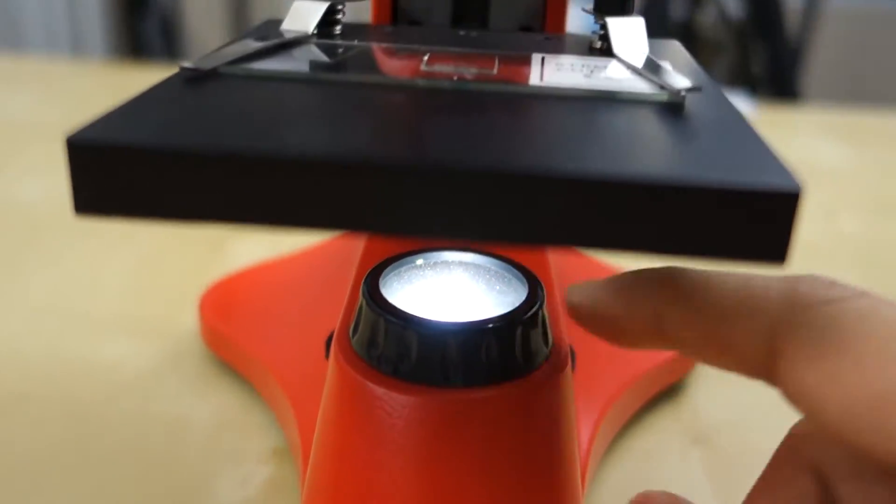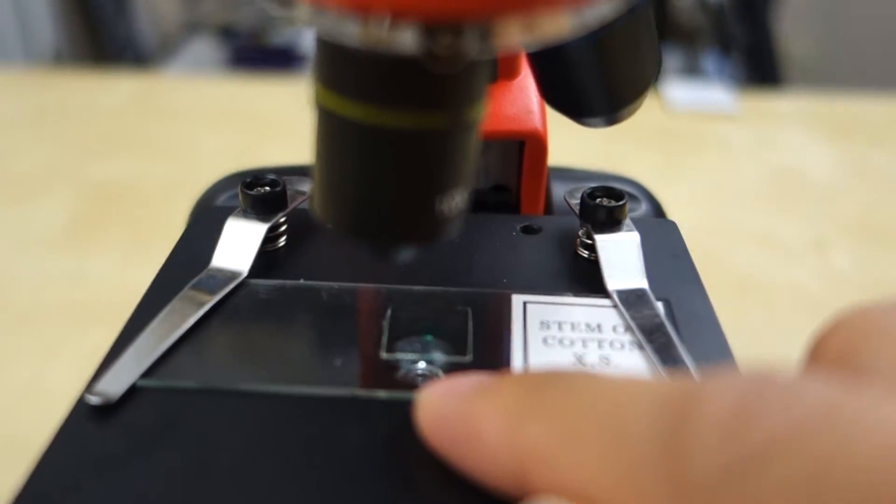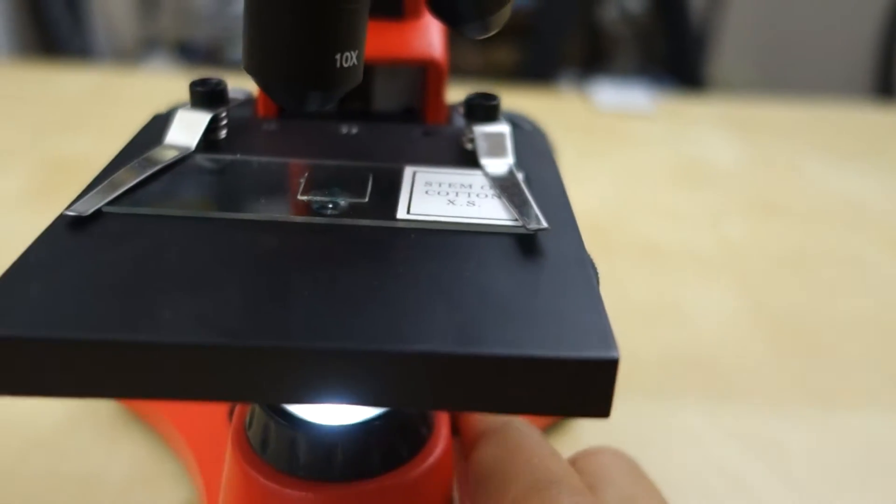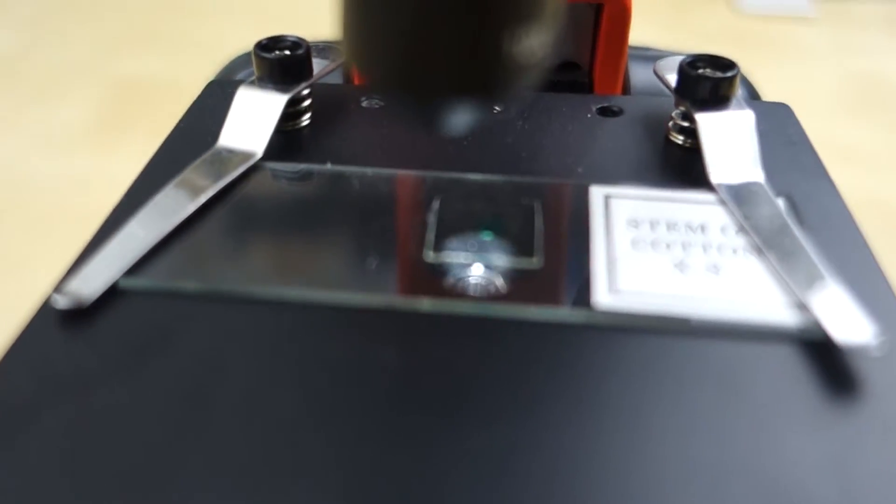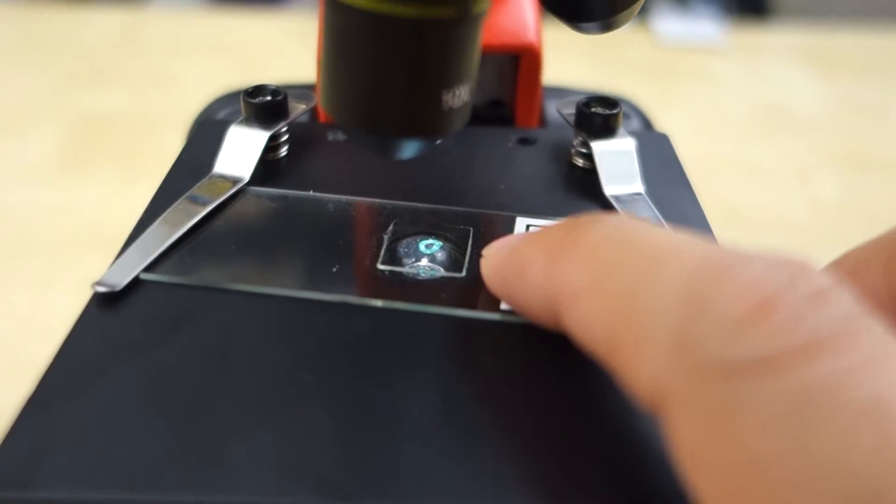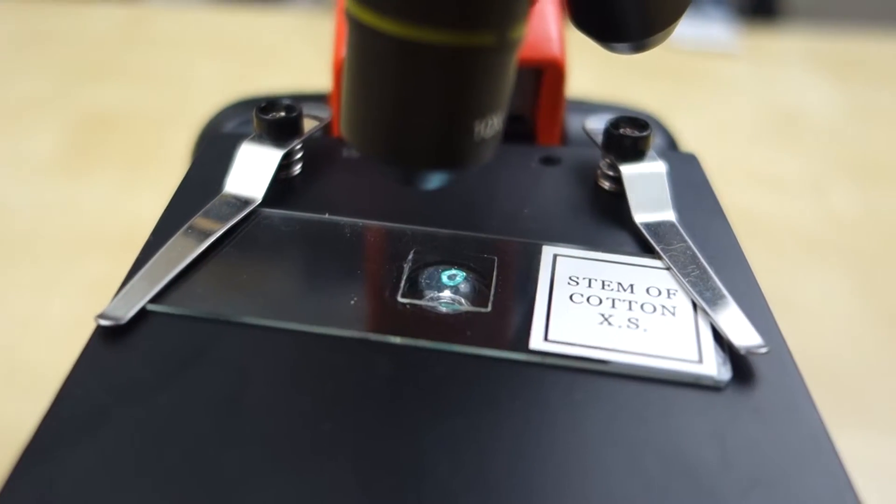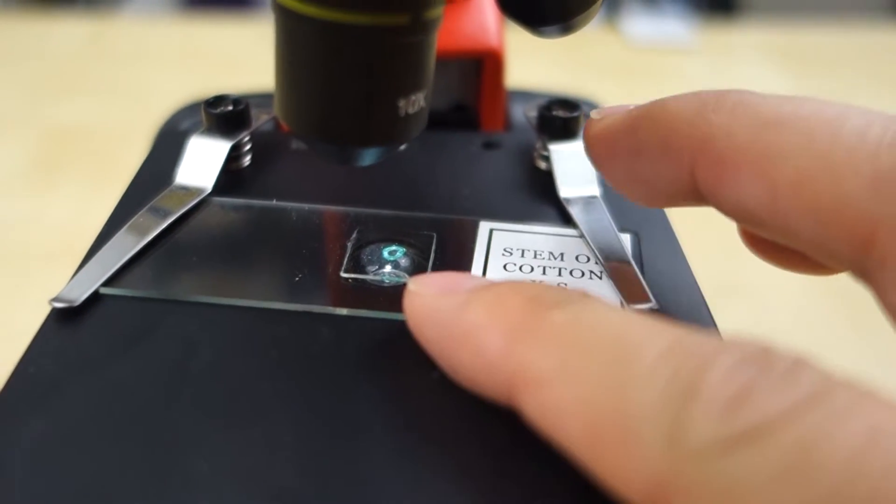So at the bottom here, we have another light that is illuminating through this little hole to that slide right now. And we can also adjust that light up and down as you can see now. So you just use the light through the slide here. And then you can see the stuff right through the slide right here. Got a little clip to keep everything in place.